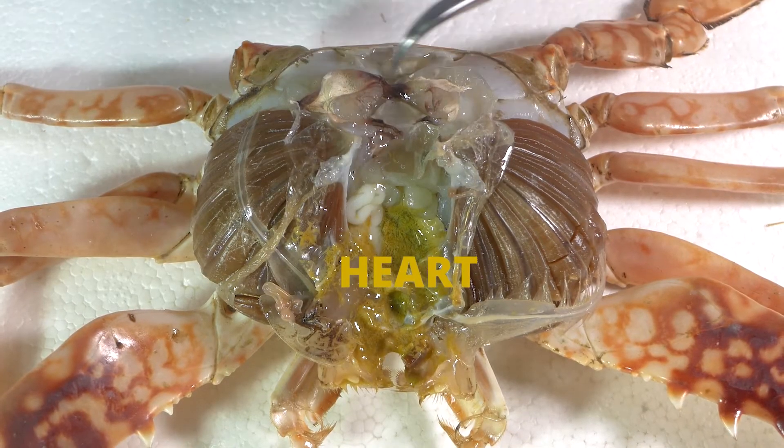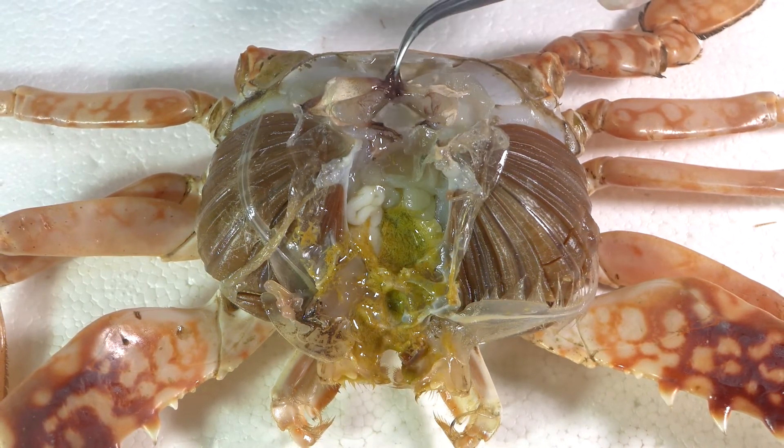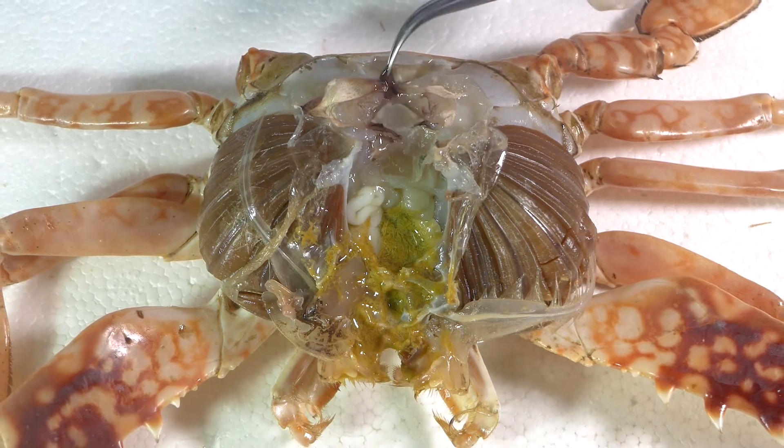Lift away the dorsal wall of the cephalothorax, or the exoskeleton, revealing the anatomy inside. The heart is located inside the pericardial sac. Be careful not to rip the top of the heart off and remove it with the exoskeleton.